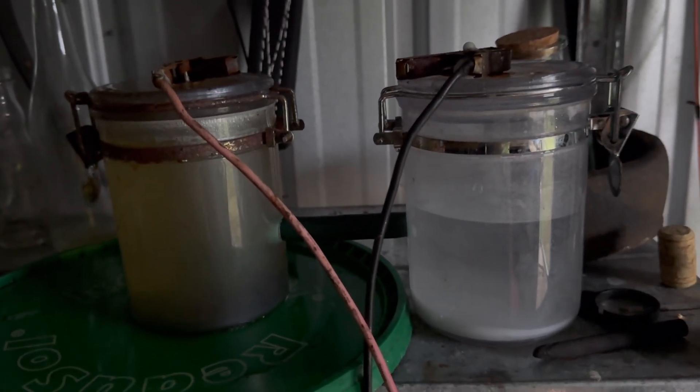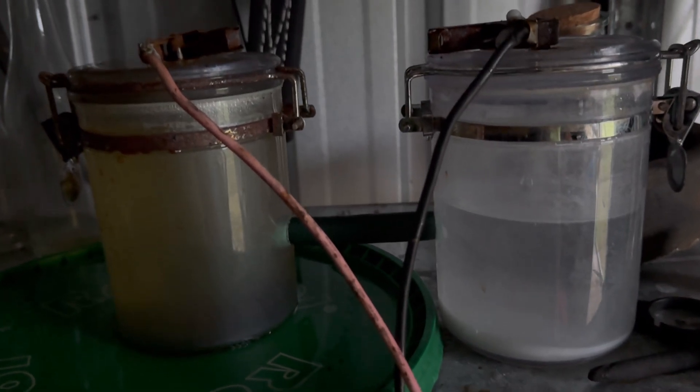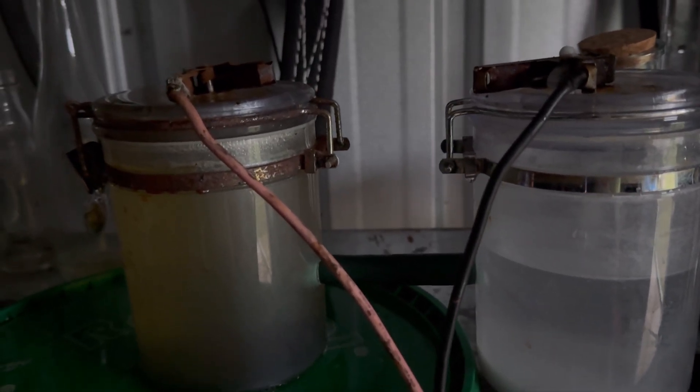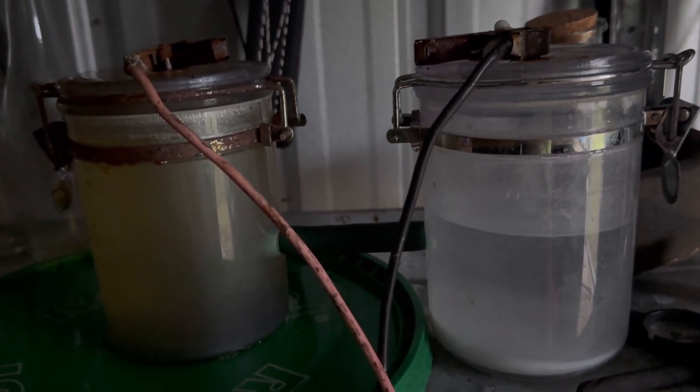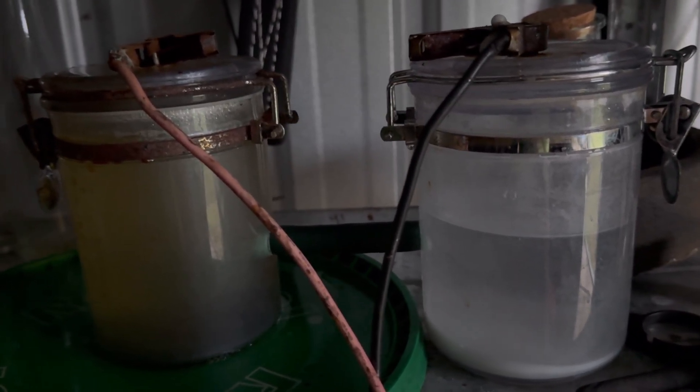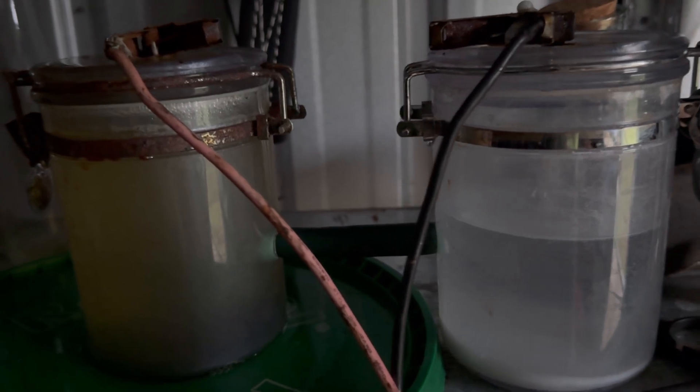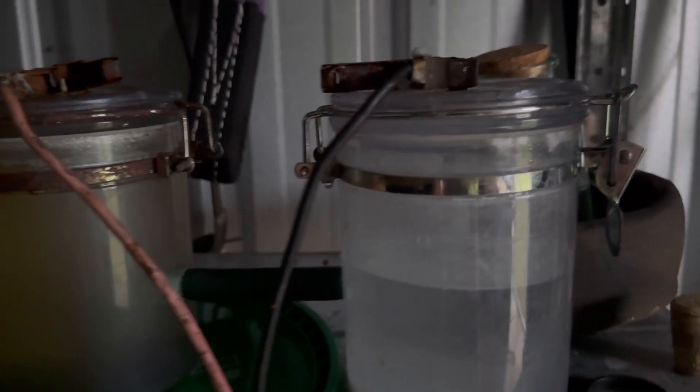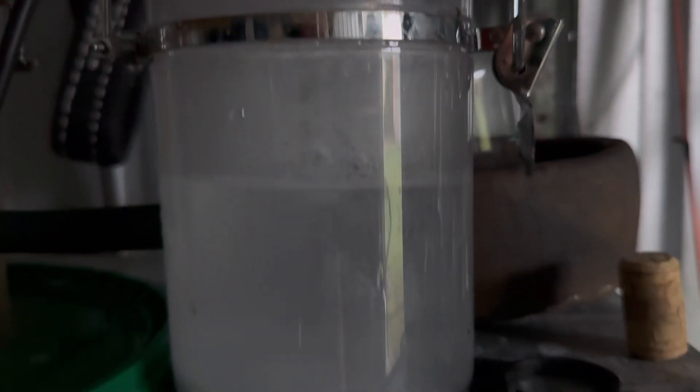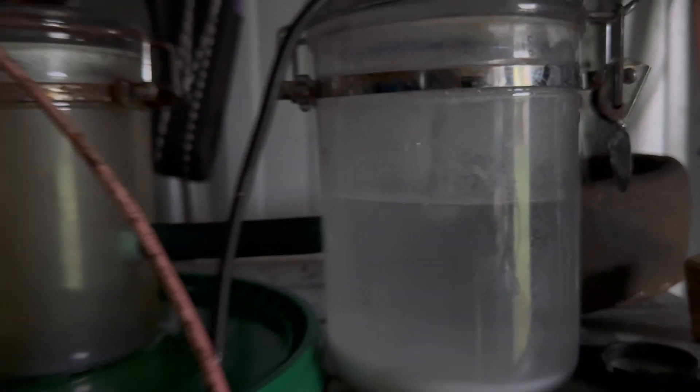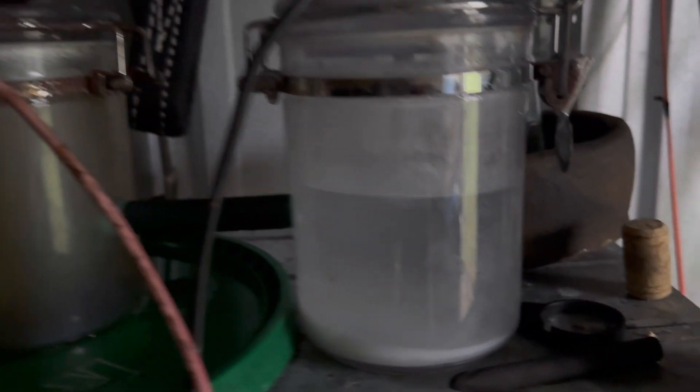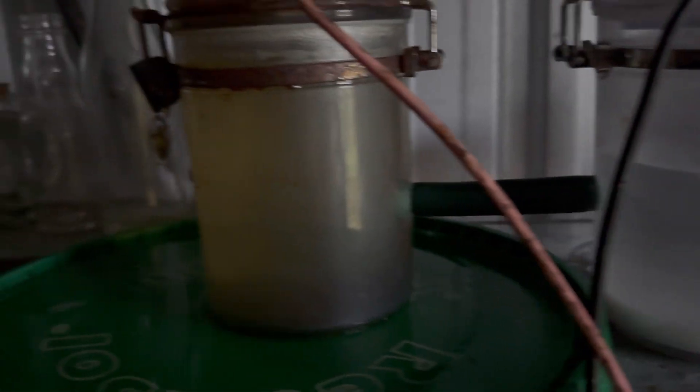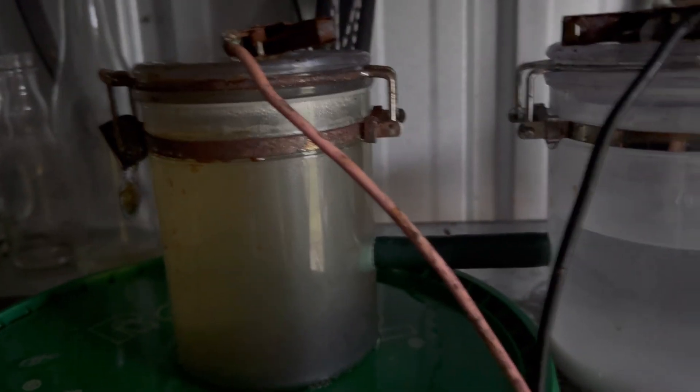Here's what I think is happening: as chlorine gas builds in the anode jar, pressure increases. The salt bridge allows fluid movement. The anode side becomes so gas-saturated and ionically charged that it starts to pull fluid across the salt bridge. Osmotic pressure and gas pressure equals chemical pump. It even seems to stop when the electrode is uncovered, like a self-regulating circuit.